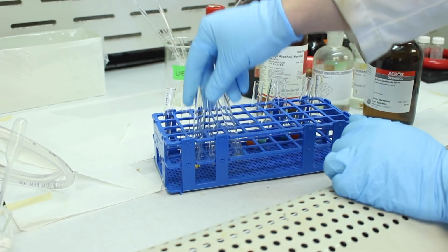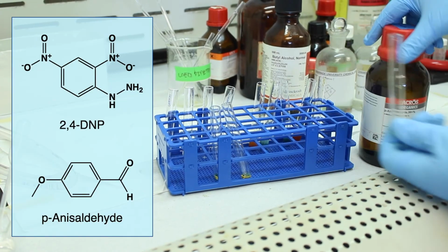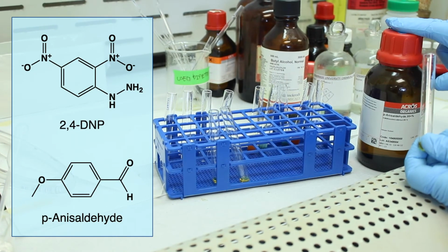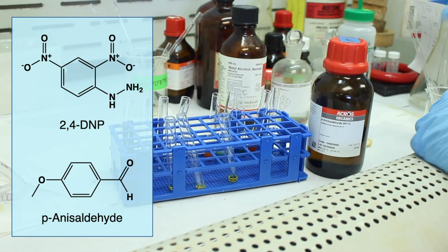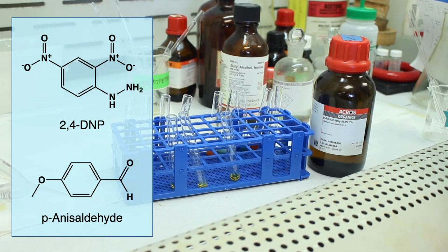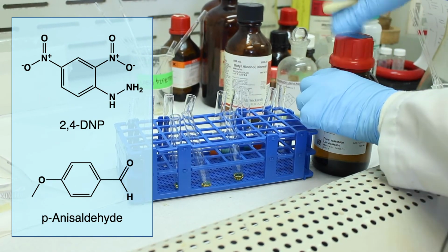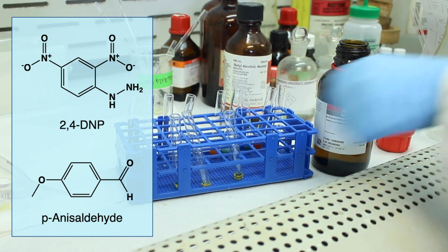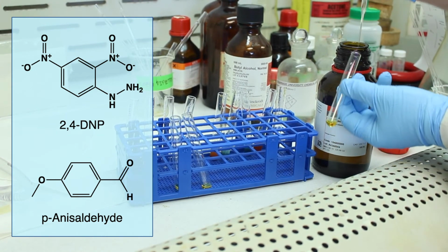All right, so we've got 3 test tubes. We're going to test 3 samples. The first one we're going to do is our p-anisaldehyde, the one we just did. So aldehydes will react with chromic acid, but they will also react with 2,4-DNP. Remember the positive test result we're looking for is the formation of a red to yellow to orange precipitate. So this is our p-anisaldehyde.